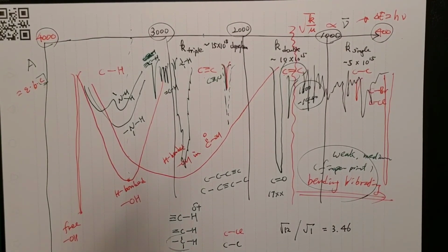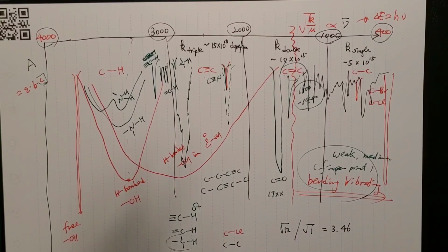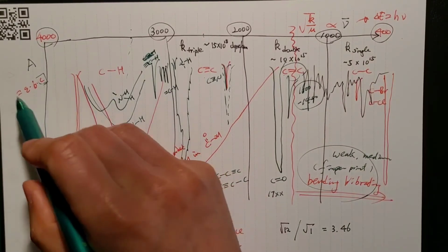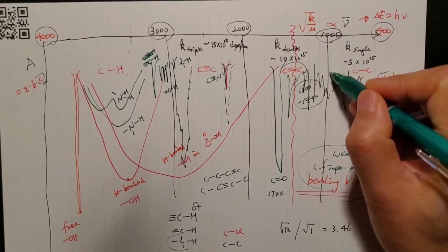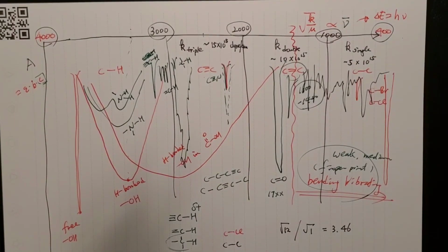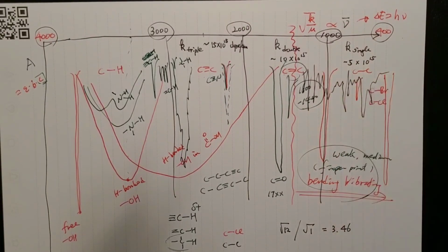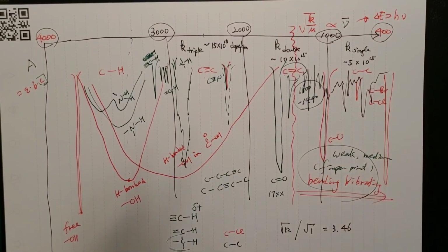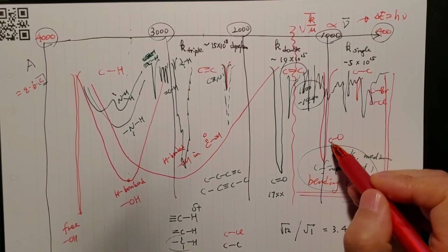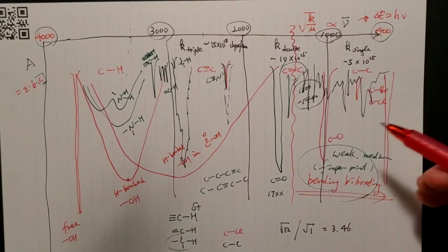In order to be recognized as a trustable, valuable signal, it should be taller than this, deeper than this, right? So one of the polar functional groups that gives a high epsilon value would be, let me use red, this tall and rather fat signal of the CO single bond. It depends on the resonance and other elements.